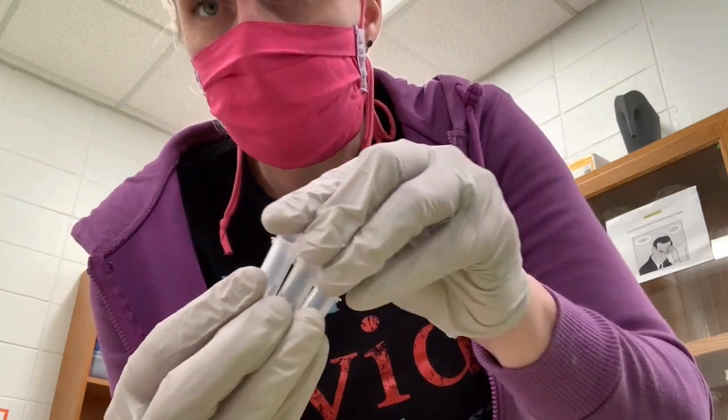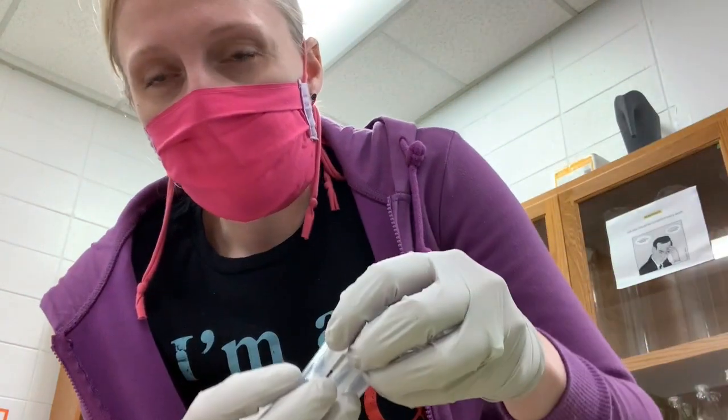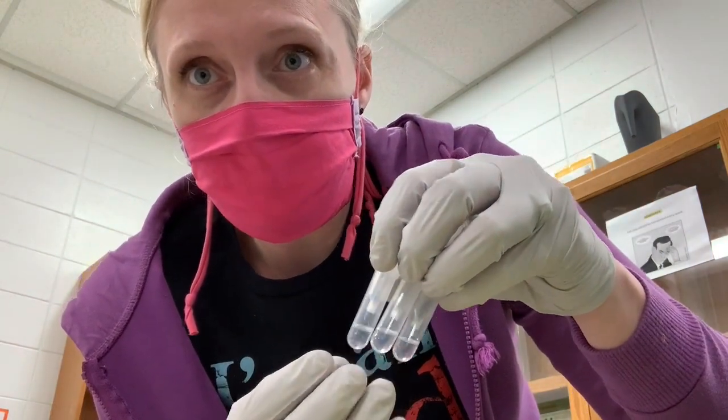And put the columns back on the tubes like this. I'm going to put them back in the centrifuge empty for one last spin of 1 minute at 12,000 xg. And what this will do is any remaining ethanol or wash buffer that's left on the column or in the tube is going to be down at the bottom of the collection tube, so that I don't have any of that material coming along with the column into my final 1.5 ml tubes. So I'm going to empty out all of my collection tubes and do one more spin, and then we'll resume.